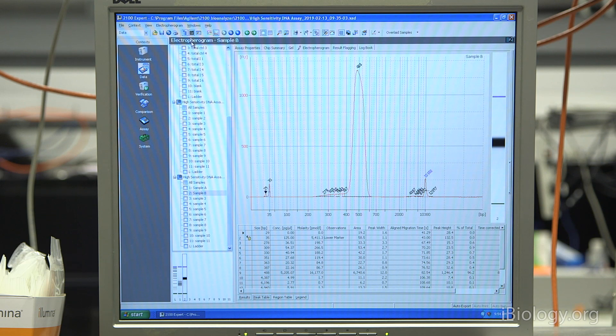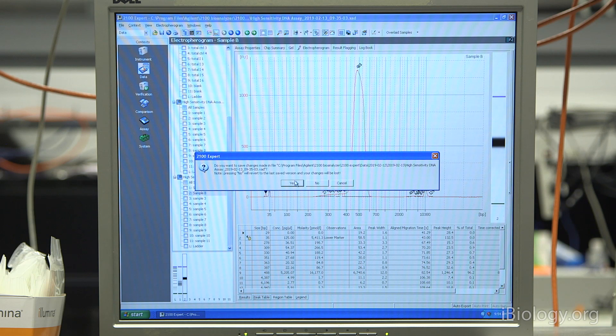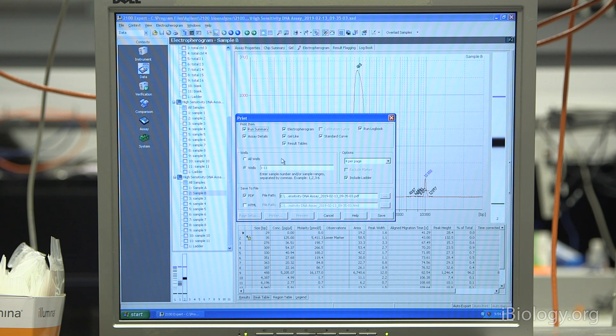Once your data looks like it's all been set and all the peaks have been properly called, you can export this as a PDF by clicking the printer button on the toolbar. Sometimes it'll ask you if you want to save any changes. I said yes, I want to save those peak changes that I made. A window will show up and it will give you options of what type of items to select. We just leave this as a default. You can tell it to print all wells or just the wells that you have samples. For us, we only had two samples.